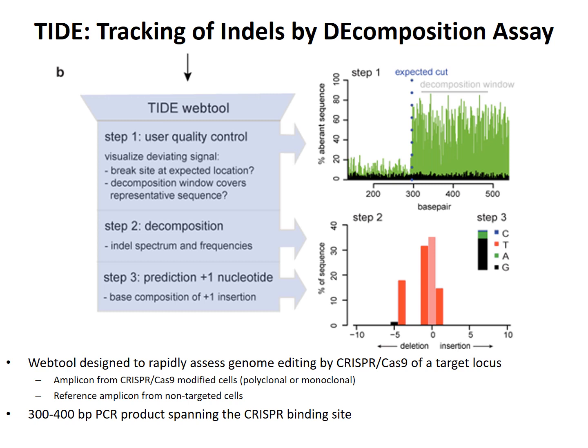And Brian will walk through exactly how to do all this during his portion of the talk. But essentially, this is the readout from the assay. And so what it tells you is, on the bottom here is the size of the insertions or deletions in that population of cells, and then the frequency of those as well. And this assay is becoming very widely used and is actually comparable to what I'll talk about next, and that's analyzing your mutations by deep sequencing methodologies.